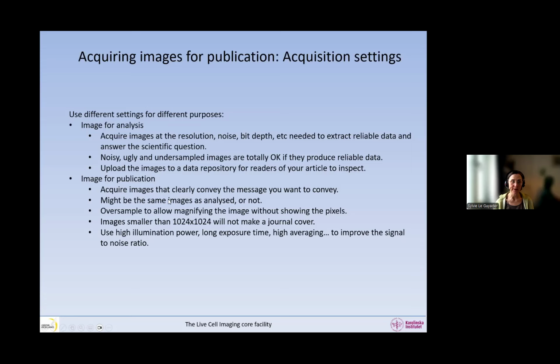And that's totally okay. These images that you put in the paper might be the same as those that you analyze. If what you want to show is the images that I've analyzed look like this, then you show the images the way they were, okay? But if what you want to convey is different, like this one is brighter than that one, for example, it's okay to have a different image.